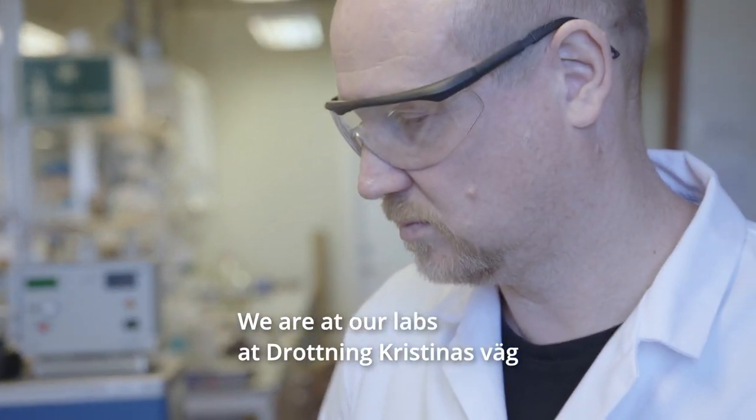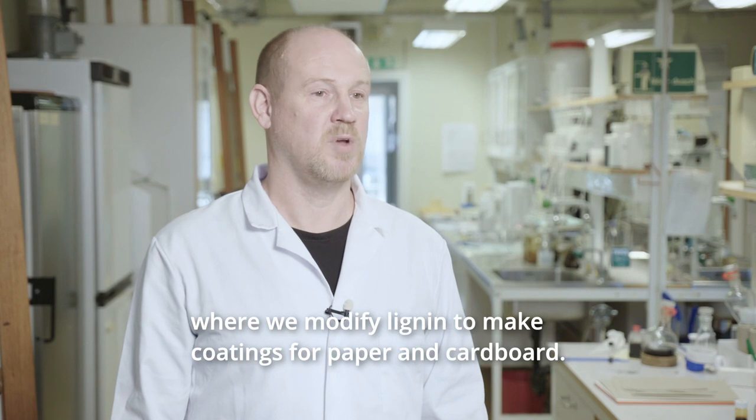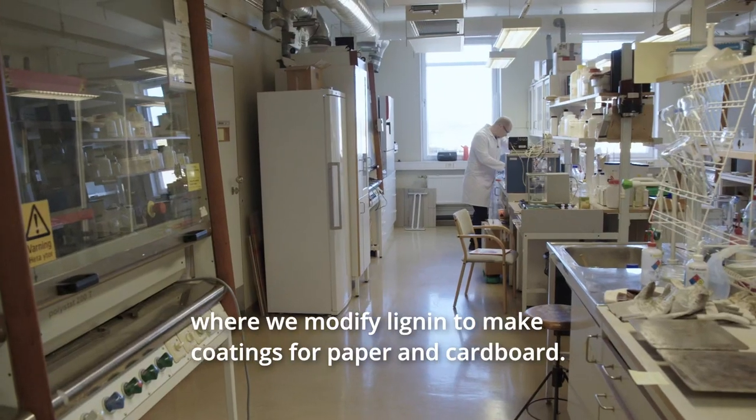We are at our laboratories at Drottning Kristinasväg where we modify lignin, and we make coatings with it and coat paper and board with lignin.